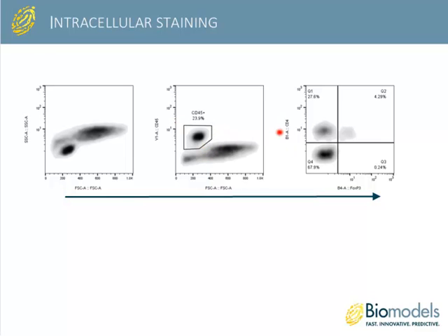And if you just look at expression of CD4 and FOXP3 on those leukocytes, you can see there's a very nice separate population of CD4 events there, and within that CD4 population, there's a few that are FOXP3, and those would be probably Tregs. So from a horrible-looking cell prep, you can go through some gating and get a really nice readout of a relatively rare cell type.